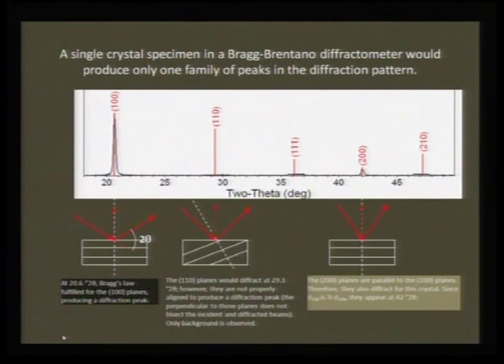Now, we will look in the next few slides at how to index or understand the repeating X-ray peaks, and from that what sort of information I can get. We will see this in the next two slides. Take for example this X-ray pattern where you only see two peaks present. In such a case, what information you can achieve is important. As you would see here, this particular peak refers to 100 and this particular peak refers to 200. So, in that case you only get those repeating peaks, whereas the other Miller indices or other crystal planes like 110, 111 and 210 are all absent in this particular reflection.